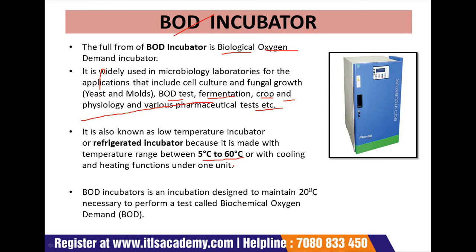This incubator is designed to maintain 20 degrees centigrade, necessary to perform the test called biochemical oxygen demand. These incubators come in various sizes and capacities, from 36 liters to 1000 liters.